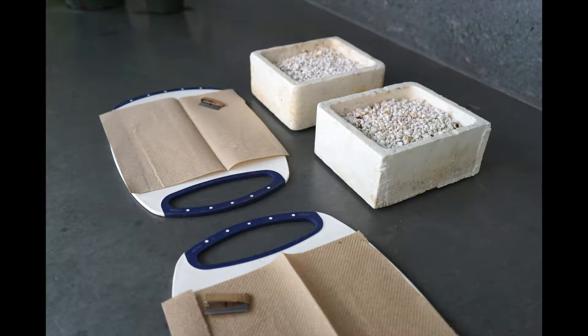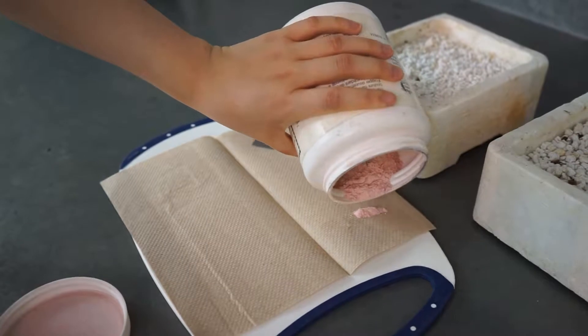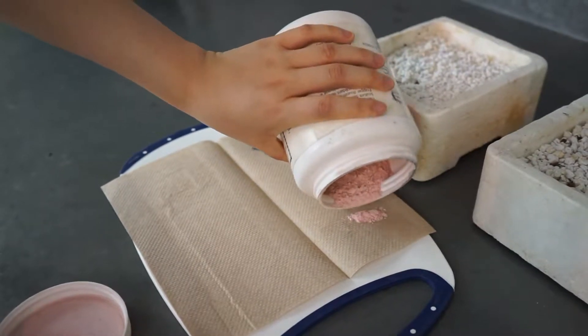There were two cutting boards, razor blades, a perlite box, and our source plant — several Pelargonium in healthy condition.